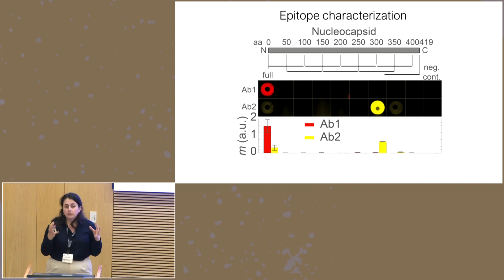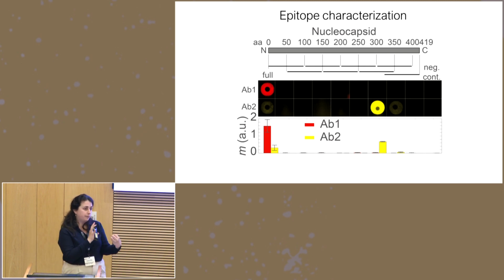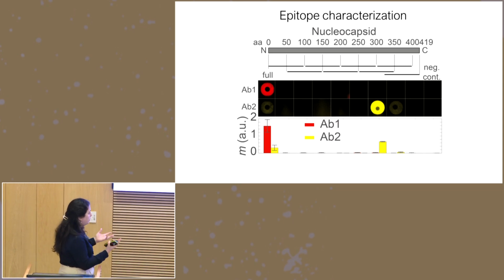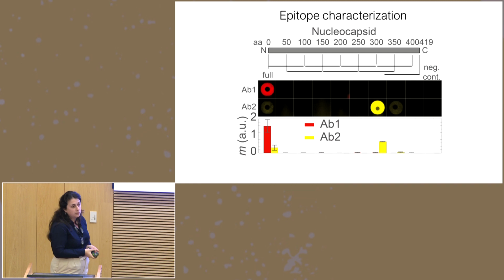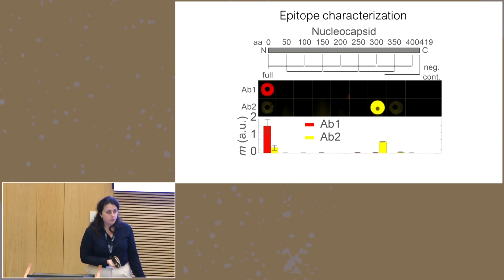What does that tell us? That gives us critical information about the epitope of antigen-antibody binding. So antibodies don't bind an entire protein, they bind a subregion of a protein. And this epitope is difficult to determine. Typically what we would have to do is purify the antigen, co-crystallize it with the antibody, and check the structure in cryo-EM, crystallography. Here we're able to very quickly scan different regions and check where the epitope is contained in our system. So that was mimicking what antigen-presenting cells do.